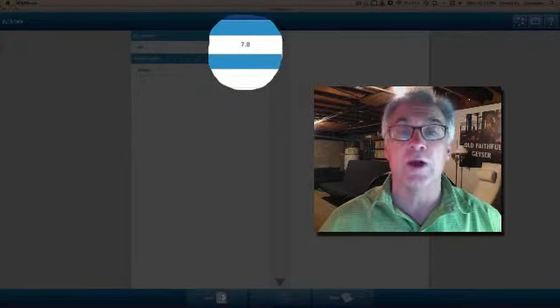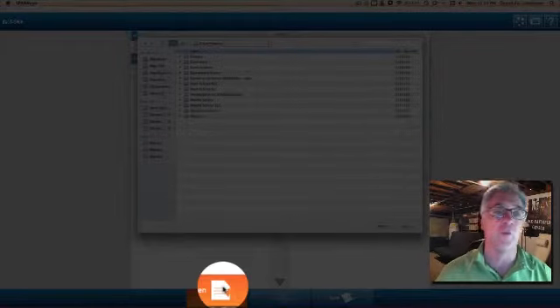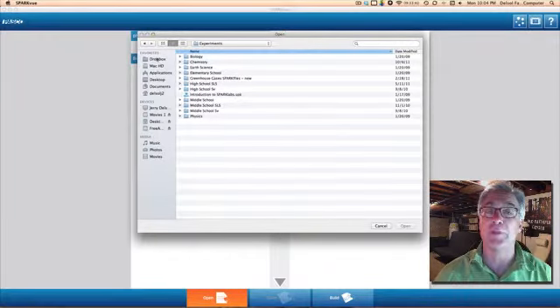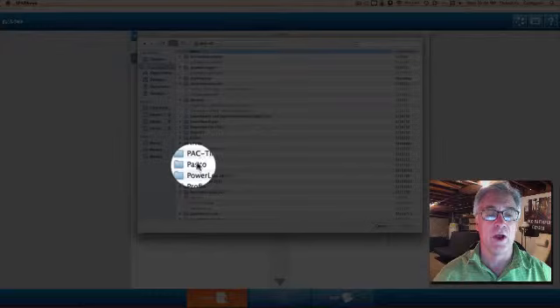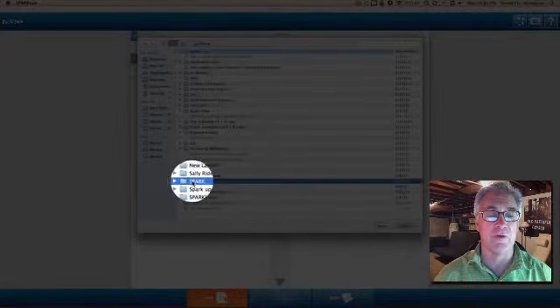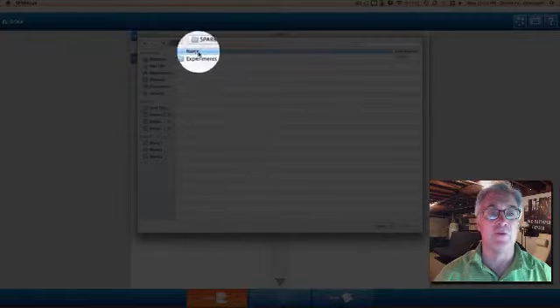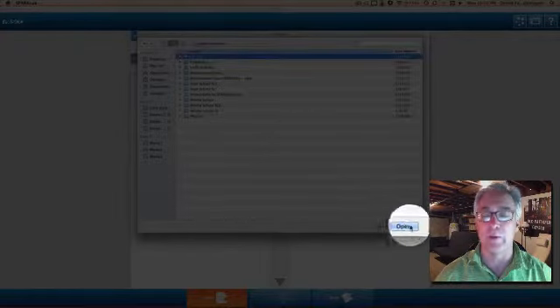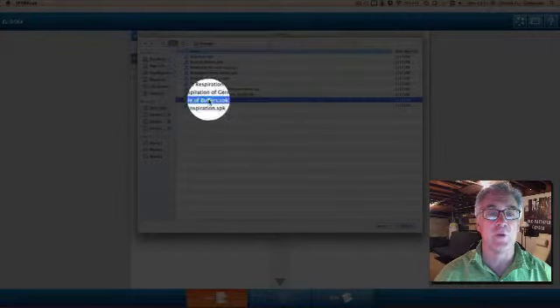So we do want to open up where we can find that. You find the folder that says Pasco, you open that, and once you find that, you're going to find Spark, and then you're going to find Experiments. You open that, and you go to Biology and open that one as well. And then of course Role of Buffers.